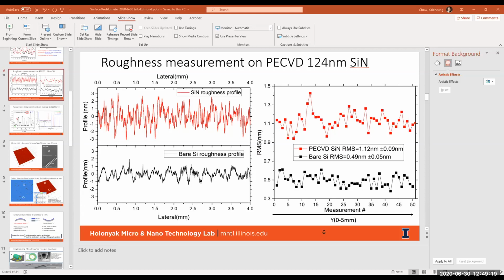Well, I'm sure you will find it much easier to use, but one of the main reasons that we decided to purchase that is for a reliable film stress measurement, and that was one reason we actually chose the high-end model: the fully motorized stage allows you to go to the same spot much more reliably than a manual stage.